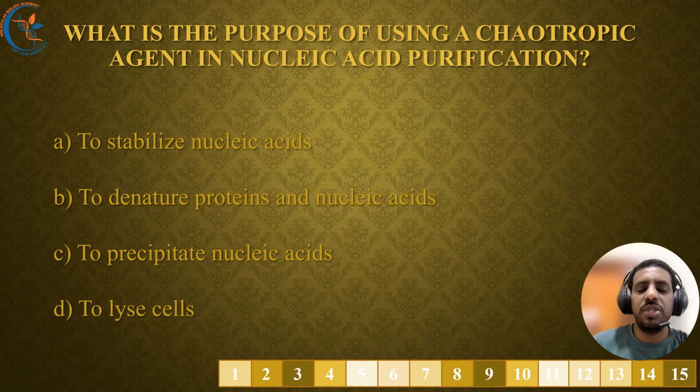Okay, let's see the next question here. What is the purpose of using chaotropic agents in nucleic acid purification?